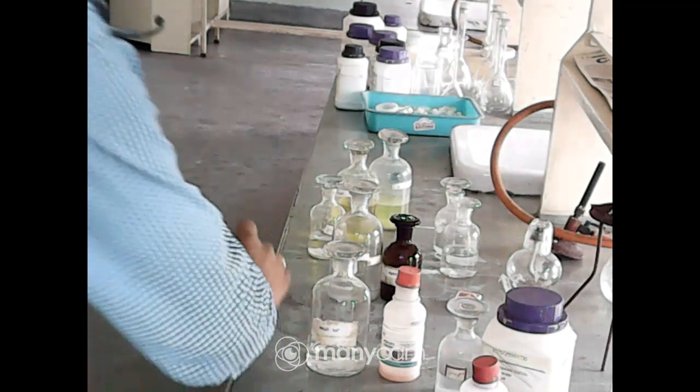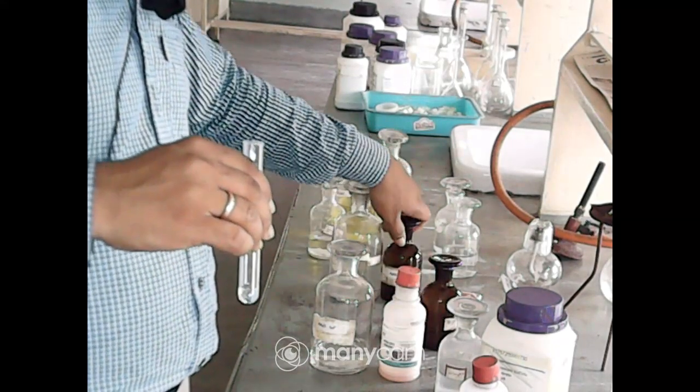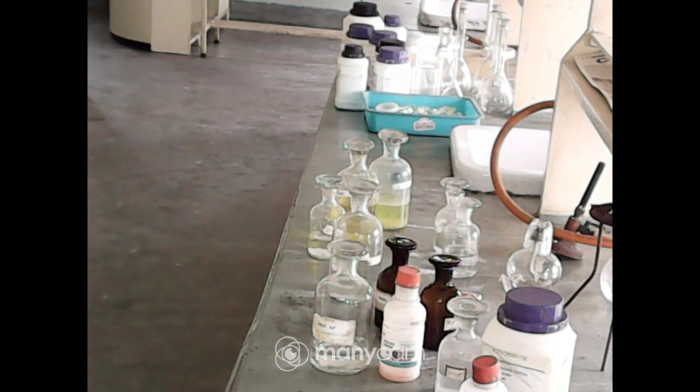You need not add much chemical. Just add a drop or 2 drops of chemical. Then it will respond if present. So chloride is absent. Next, we have to check the test for sulfate.